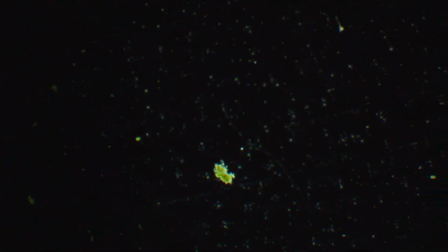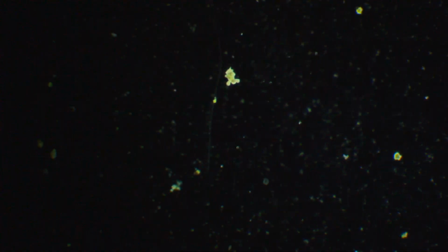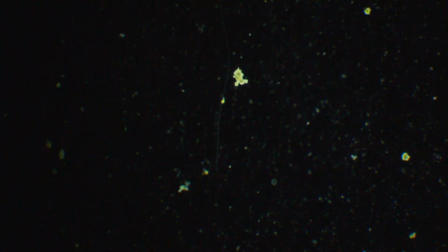We're looking for microorganisms. Rotifers mostly is what we usually find. But I would love to find a tardigrade. That, to me, is going to be like... I know I'm going to find one eventually, and I'm going to find it here on a stream. I just don't know when that is going to be. I got to find more lichens to examine.